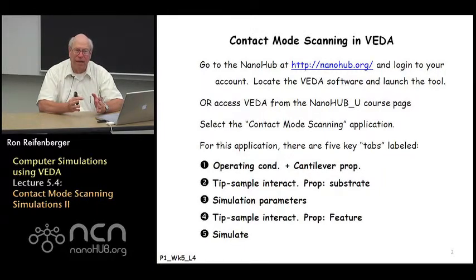So my recommendation is don't select the tip dilation box at the beginning. Make sure that all the other parameters that you select are appropriate, and then you can go back and click the tip dilation, and you won't be wasting your time waiting for a calculation that's meaningless.